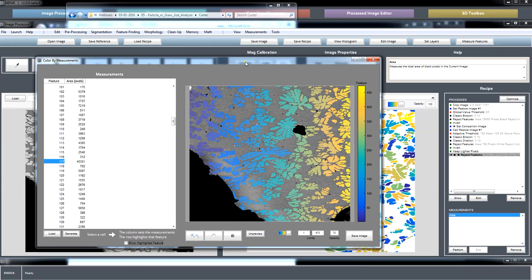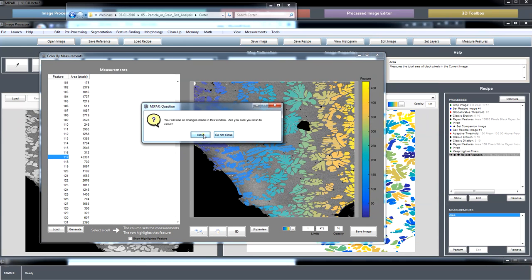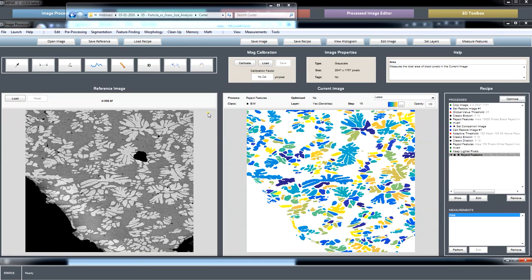Romulo, does that answer the question about automating the ID of measured features? Okay, great. Thanks very much. But I appreciate your suggestion of putting numbers on top of the features, because in the cases where you just have, say, 15 features in the image, it might be helpful to see them labeled with their number automatically.